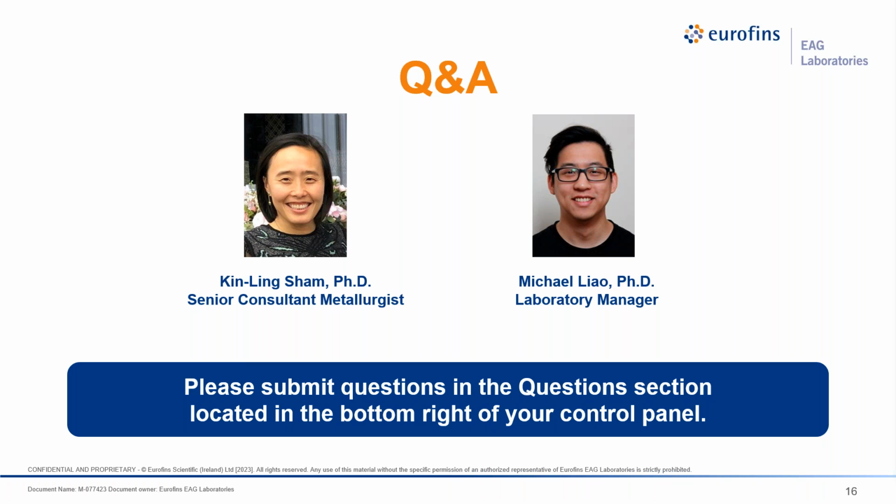Now, you can test at different testing mediums. So if for some reason blood plasma, like PBS, is not what you want to test it in, or if you want to test slightly higher, so more basic, or slightly lower, you can do plus 10%, minus 10%, and test in the range.